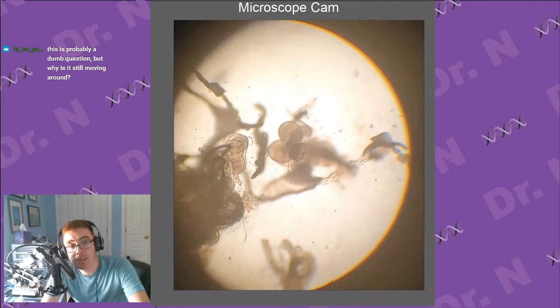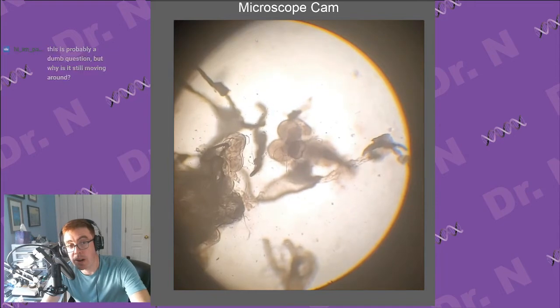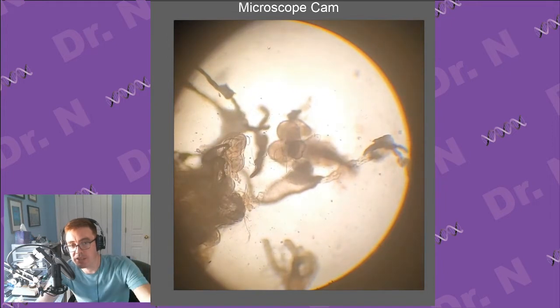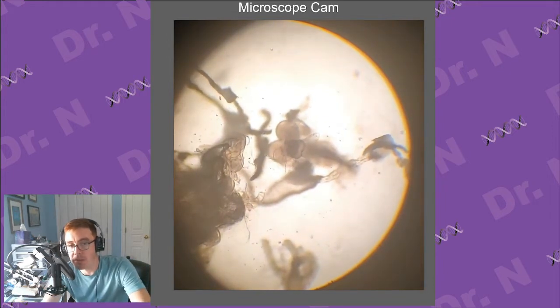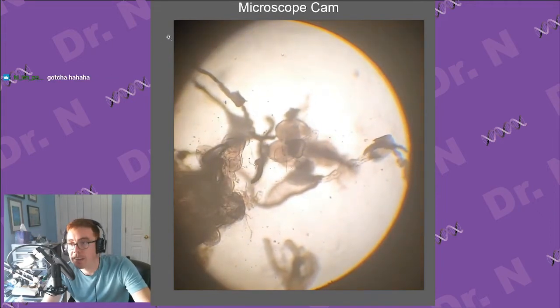Why is it still moving around? Honestly, just because neurons are still probably firing. They're pretty simple. Also, my elbow is resting on the same table, so that's probably just my movement. If I get my hands off the table, there, it stops shaking. What you're seeing is just the small movements from me, moving my forearm around to move the mouse.